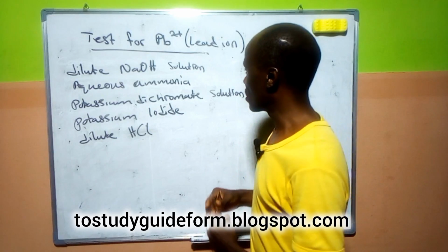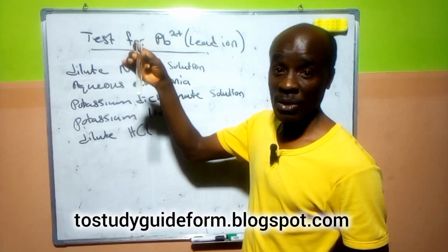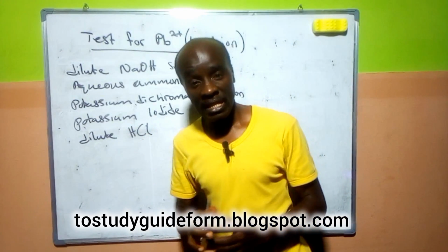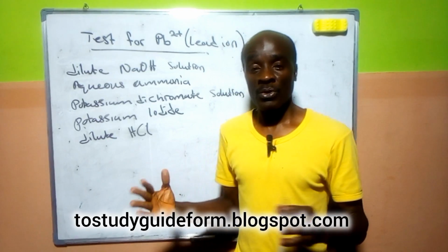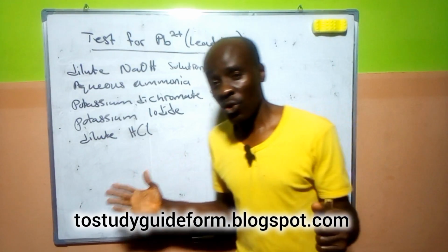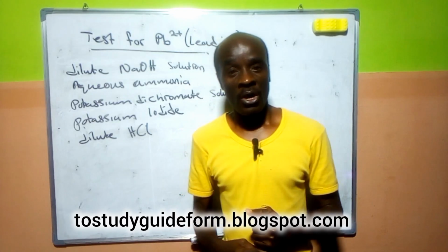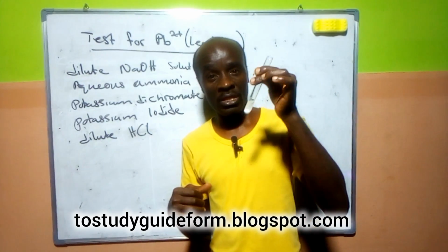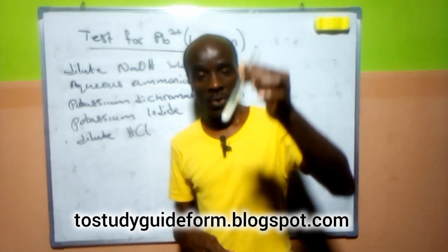But in this case, this heavy precipitate we have here is telling us that what we have is likely to be, if you're going to put your inference on an unknown substance, your compound you're testing, then in your inference what's supposed to be there is calcium ion or lead ion. So you can see that.